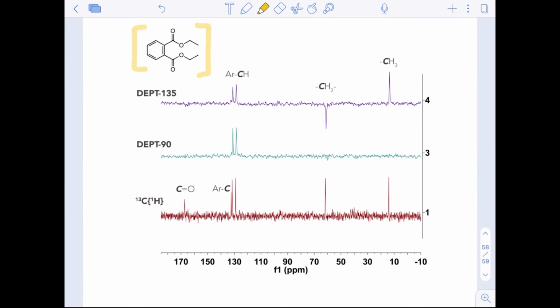Diethyl phthalate here, let's just identify a couple of signals, right? A, B, C, D, E, F on the top is the same as that on the bottom, and so we should see 6 peaks. But what's really important here is the idea of a couple of these that we see. The aromatic CHs are kind of shoved in here, and the aromatic C for carbon D is a little hard to see as well. But we'll try to elucidate these 6 peaks as much as possible, okay?